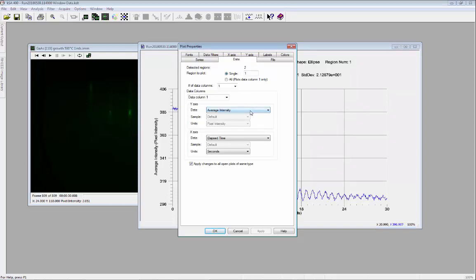Average intensity is typically used. Note that peak or centroid intensity can also be chosen, but these data are often saturated and thus not well suited for damped sine fitting. I can also choose which region or regions of interest to plot. In this case, I will choose Region 1.